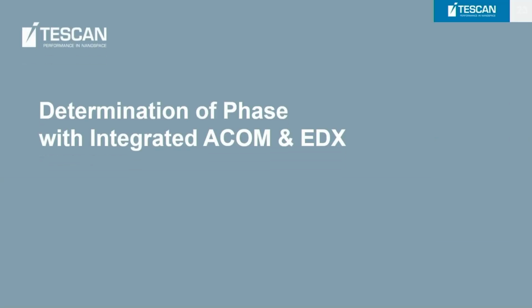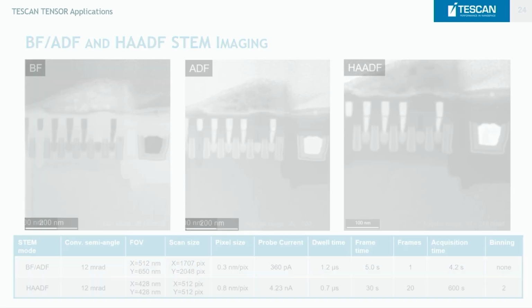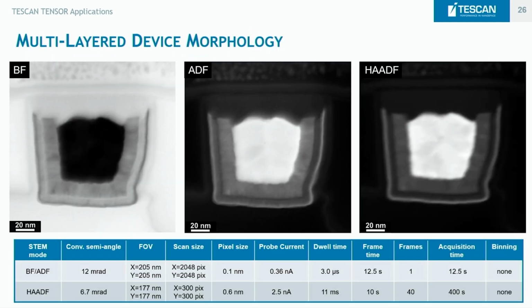And then another example, this is a semiconductor device that has a lot of activity here. It's a Samsung 5 nanometer we deprocessed. It's a FinFET. And so I wanted to share with you some things with thin films. Particularly, we can get imaging, we can get EDS, do very good work here, but we can go a little bit farther. So I wanted to work with this structure here.